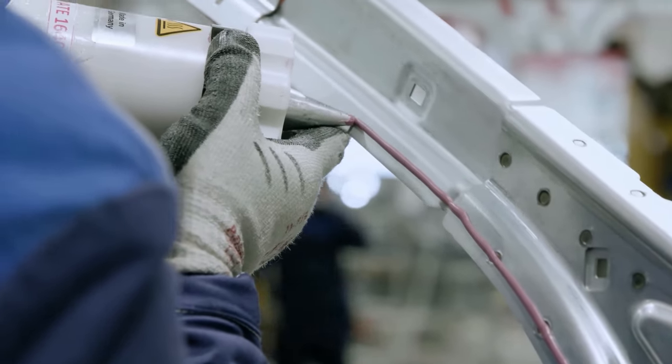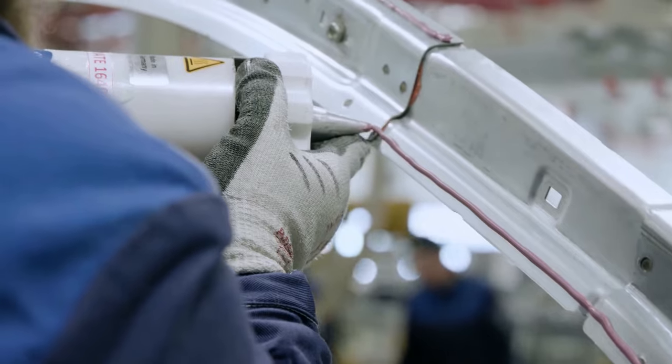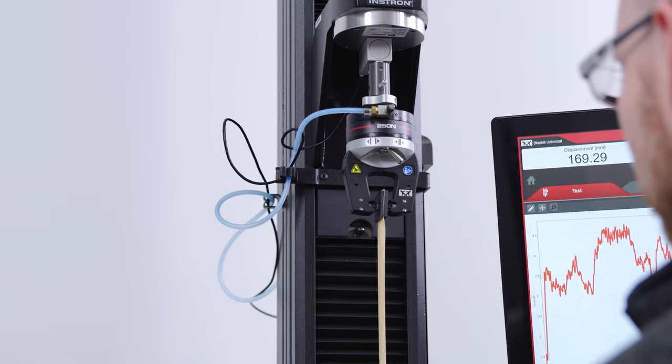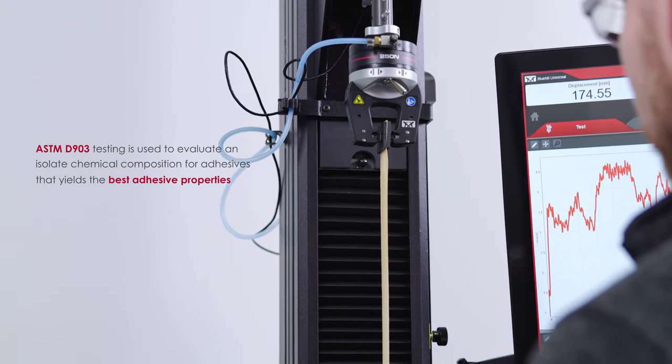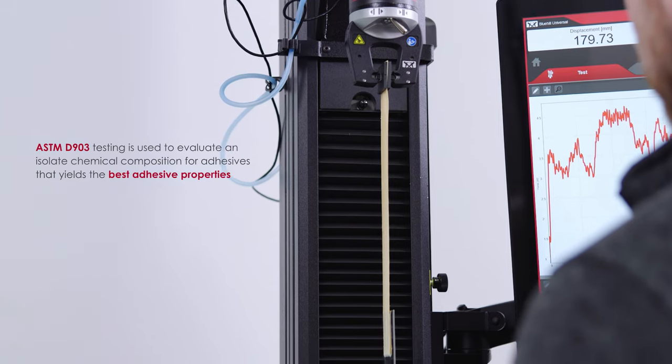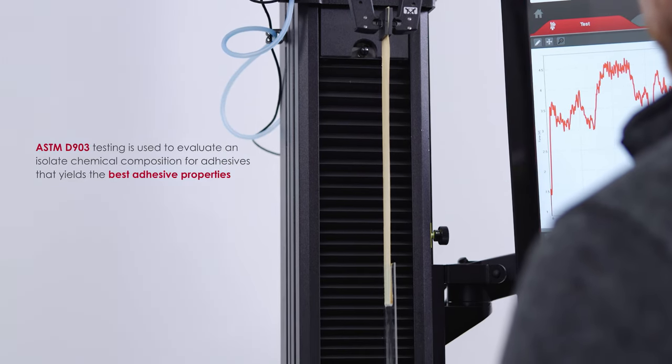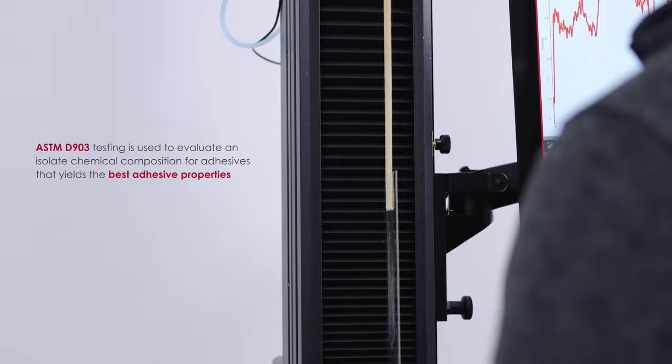Testing to ASTM D903 is mainly performed for research and development purposes. In most instances, ASTM D903 testing is used to evaluate and isolate chemical composition for adhesives that yields the best adhesive properties.